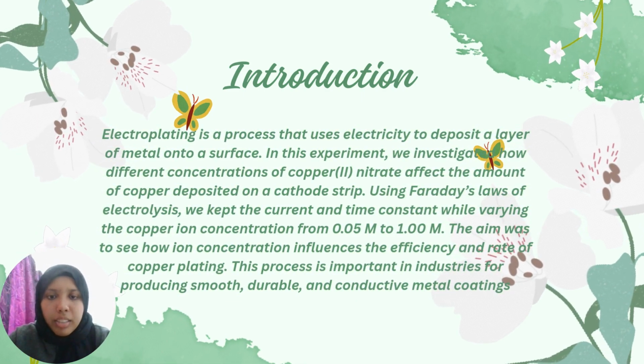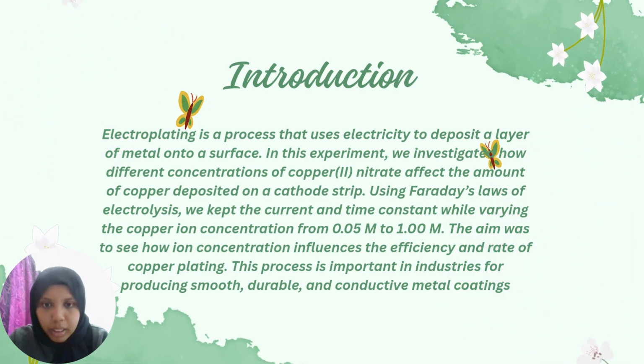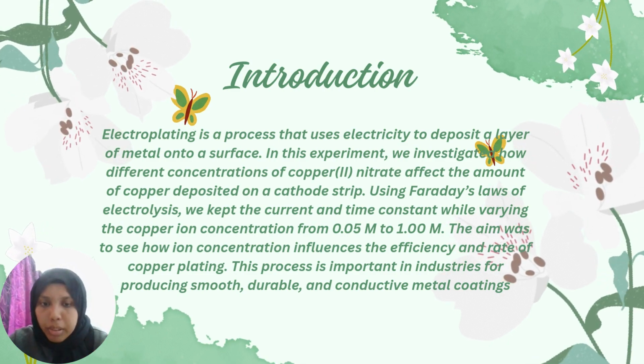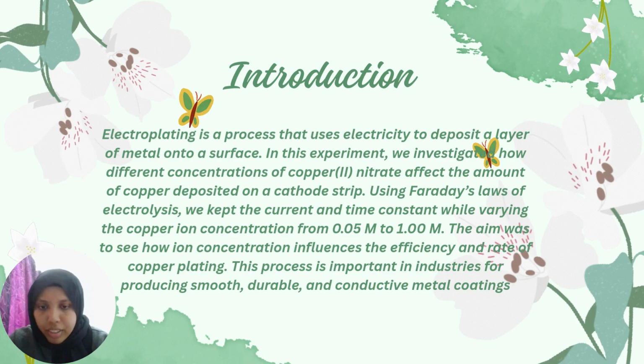By applying Faraday's laws, we examine how varying copper nitrate concentrations influence the mass of copper deposited with constant current and time. This experiment not only reinforced theoretical concepts but also highlighted the real-world relevance of electroplating in industries such as electronics and metal finishing.